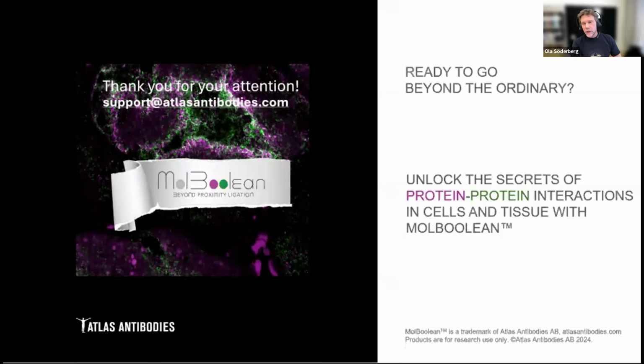Do they bind the protein of interest, yes or no, when you have all the different controls. But it can be good, if you want to select antibodies, to use antibodies that can be used for pull-down. If you can pull down a protein complex with antibodies targeting protein A, for example, can you pull down protein B? Then you know that the antibody is not targeting the epitopes used in the interaction event. It's a really good question, that was.